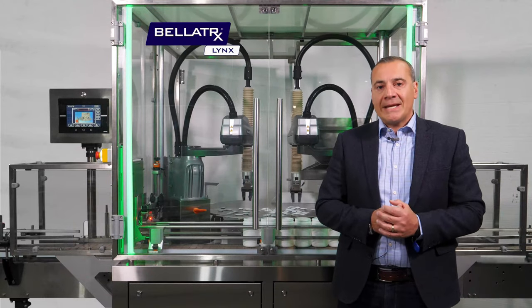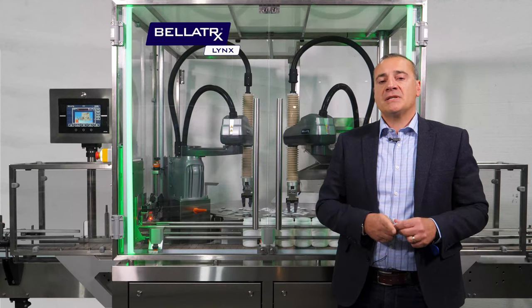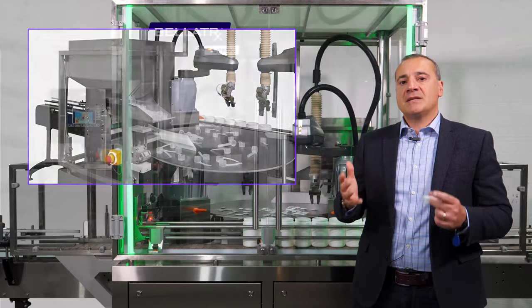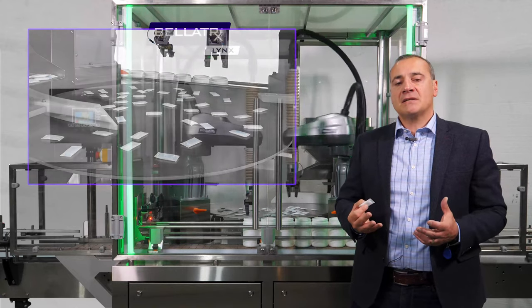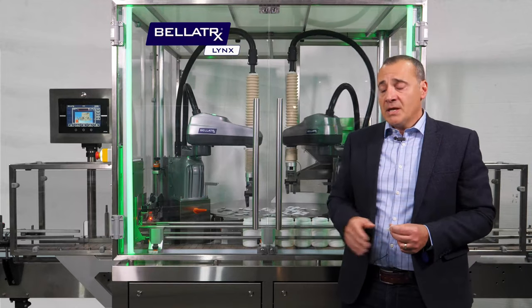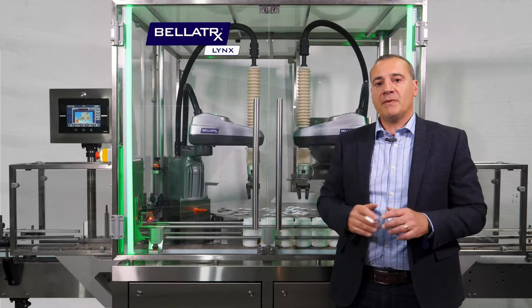In order to understand how the LINX part feeding system — in this case a desiccant inserter — addresses these changeover challenges, let's walk through the setup of the machine. We have a hopper in the back where you put the desiccants in, a vibratory feeder that dispenses desiccants onto a rotary table. There's a camera that determines the amount of desiccants fed onto the table and acts as a call sensor for the hopper to dispense more or less product as the turntable is moving. There are cameras on top, mounted on the top frame of the machine, that constantly take pictures of the configuration of the desiccants on top of the table.